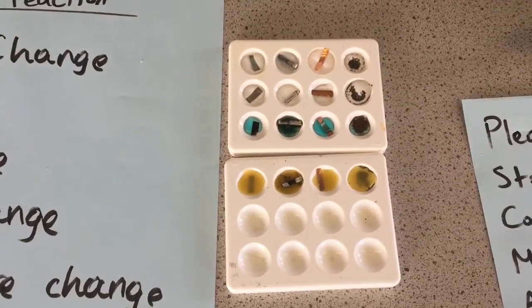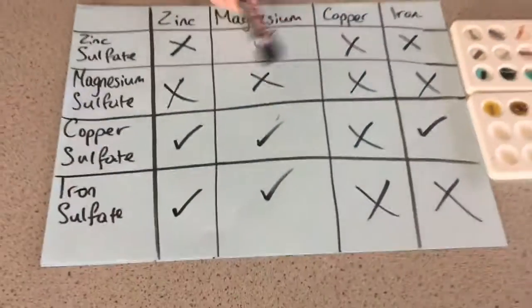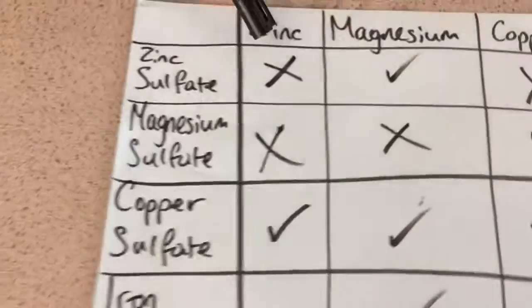So if we pause this now, we will show you after we left this for sort of 10 minutes and then we looked at the results, and I'm going to draw them up in a results table. So our final, we're going to look at some results here. We've left this for a while. We're going to focus on zinc's column first. So zinc is the first column, right? Zinc first column, no surprise.